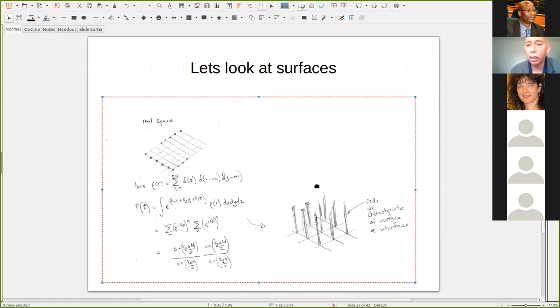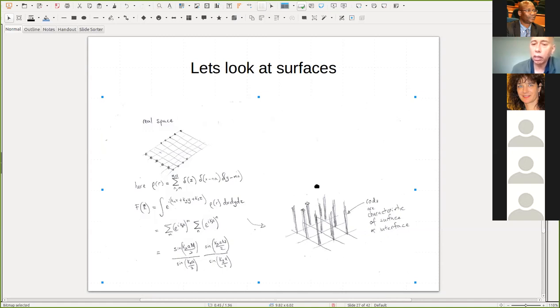But comparatively speaking, you can see it's very long in one direction and it's ordered in the other. And that's a characteristic of a surface. And in fact, I've measured things like that at the beamline. So that's one way to get to it. And I just want to point out the other way to get to it, also conceptual.